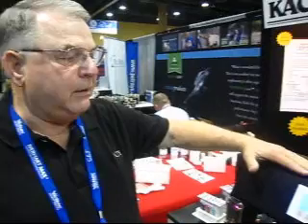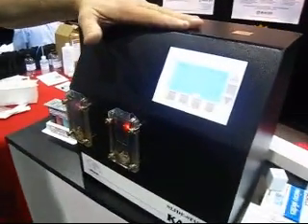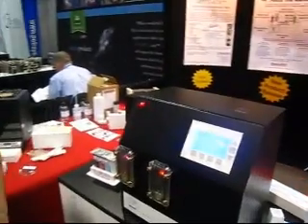The unit can make different colors for each of the different cells. It's programmable and can accommodate up to five different doctors or technicians, so you can have all of your colorations the way you want from doctor to doctor.